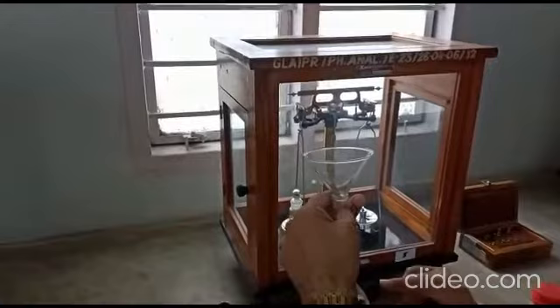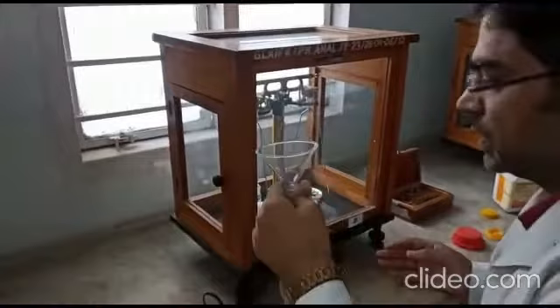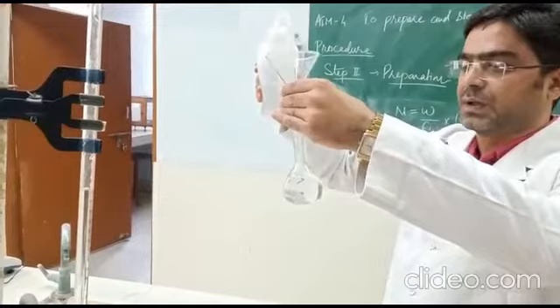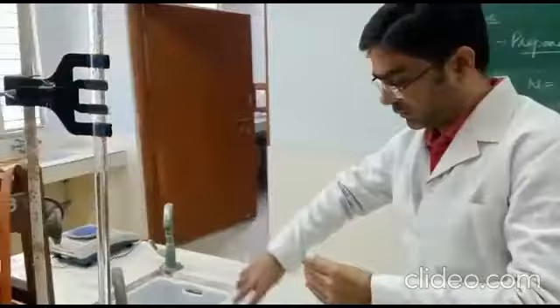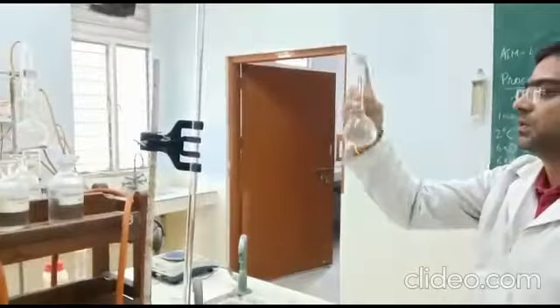We add distilled water and dissolve the oxalic acid completely before making the volume up to 100 ml. Using the wash bottle, we transfer distilled water carefully up to the 100 ml mark on the volumetric flask. We shake it so that it dissolves completely. We analyze whether it has dissolved, then keep it aside.